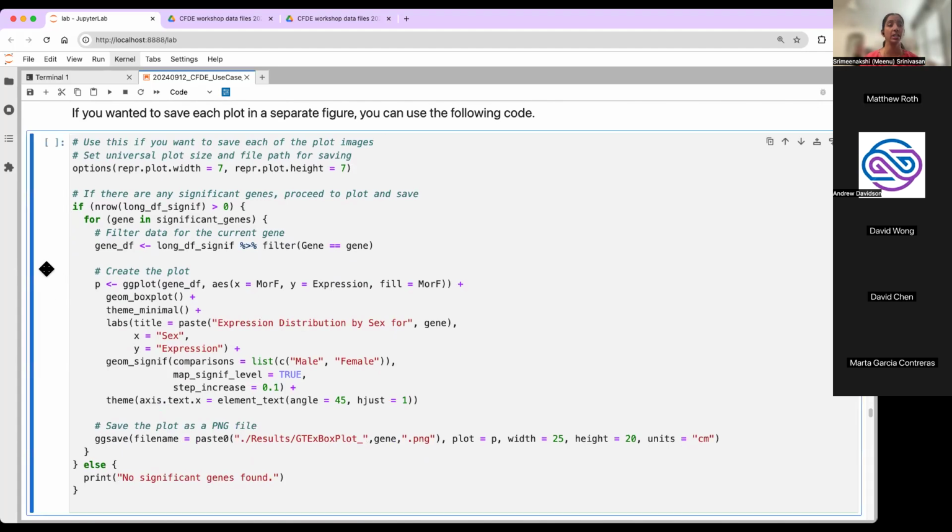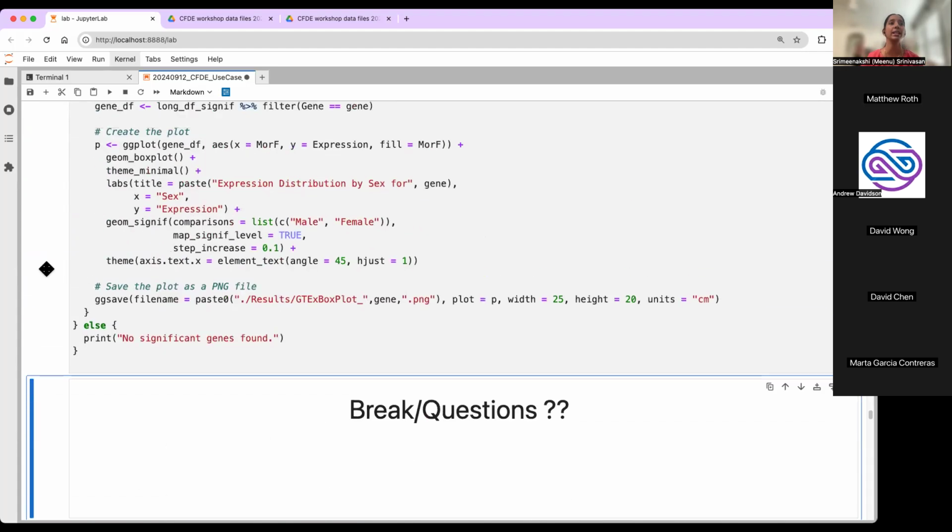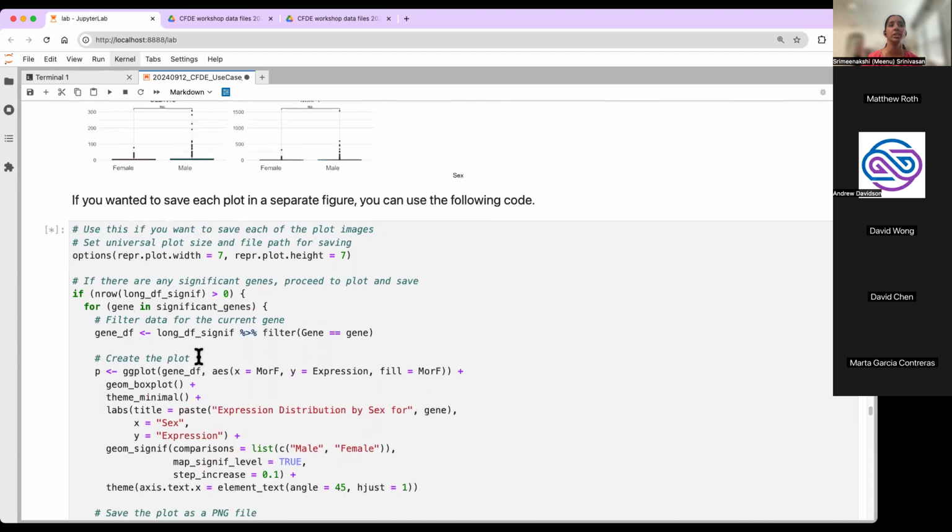I can run it just for the sake of showing you, but we are not going to see any output over here on this page, but in your folder, if you're running this along with me, you should now see your results folder populate with several PNG files. And it does take a minute again because we do have 66 plots to put up over here.